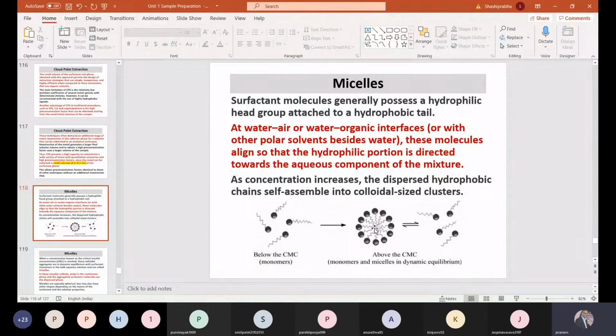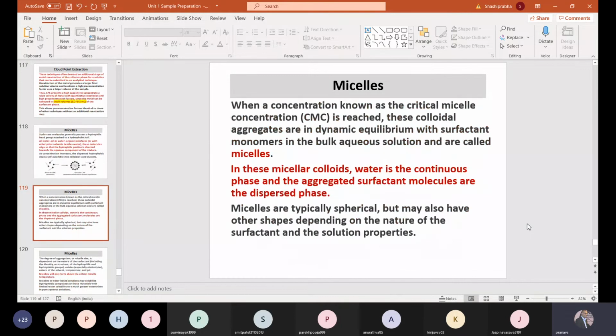This is hydrophobic in nature, the center thing, and the outside thing is hydrophilic heads, and these are the tails. और जो भी एनालाइट होता है जो हम पानी में से लेते हैं वो इसके अंदर ट्रैप हो जाता है और एक अलग फेज में चला जाता है, इसको हम बोलते हैं मिसेल। तो ये मिसेल बनने से हम इसको सेपरेट कर सकते हैं. And this is known as, as I said, critical micellar concentration.